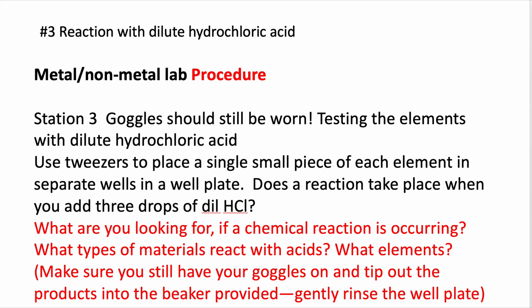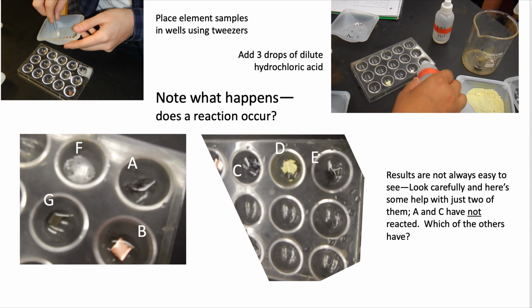You don't want all that cloggy stuff down the sink, please. And once you've tipped the solid material and the liquid out, gently rinse the well plate low in the sink. And here you've got some results, the bottom 2 diagrams.